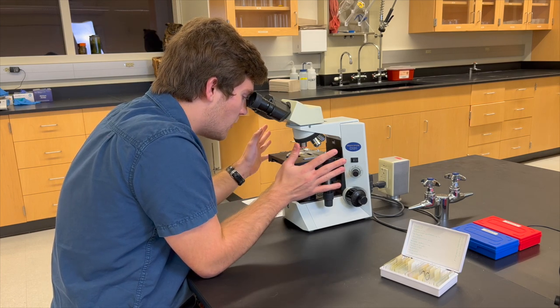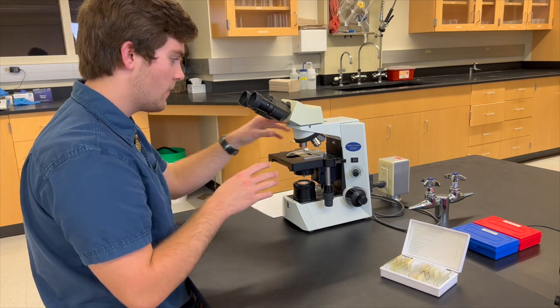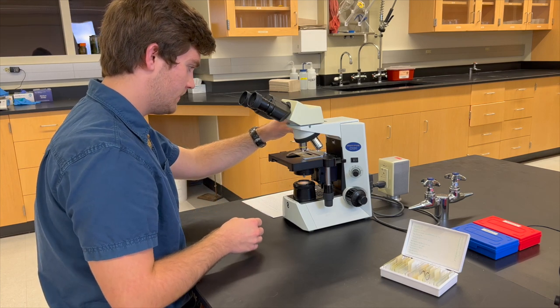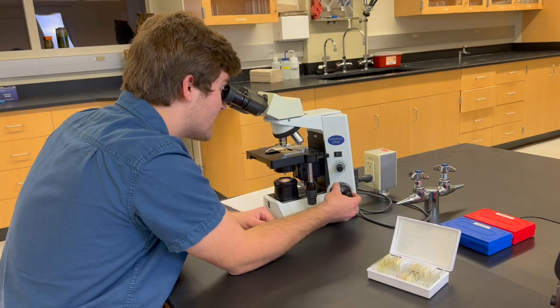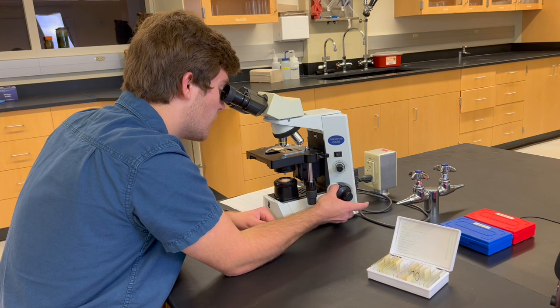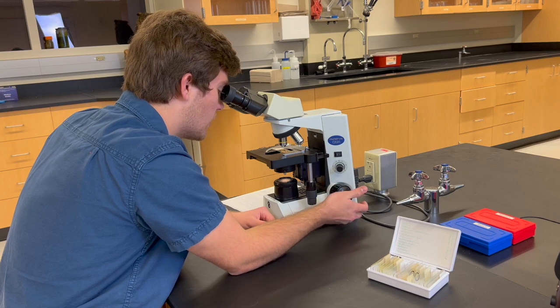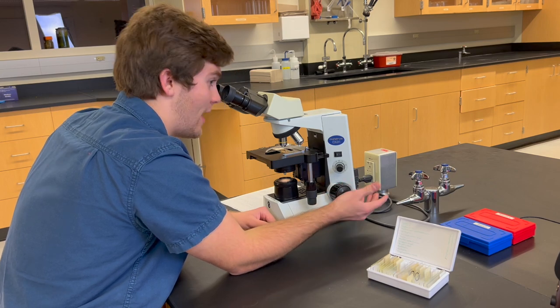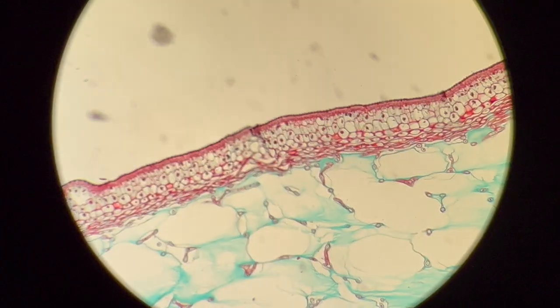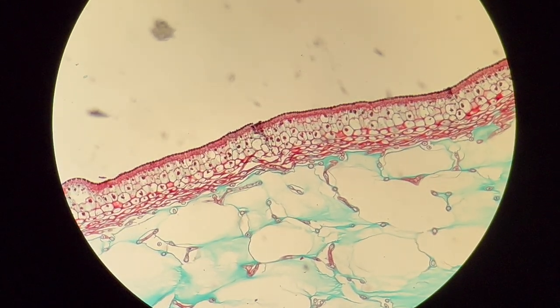Now that everything is in focus, we are completely done using the 4x lens for now. We're now going to rotate to the 10x lens for further magnification. This time though, when you're focusing, be sure to use only the fine focus knob instead of the coarse focus, as when you're this close to the slide and you try to move the coarse focus too much, you could actually break or damage the slide, and that's obviously problematic. We can also slightly rotate the fine focus knob back and forth, creating the sense of a three-dimensional structure underneath the lens. This is called through focusing.